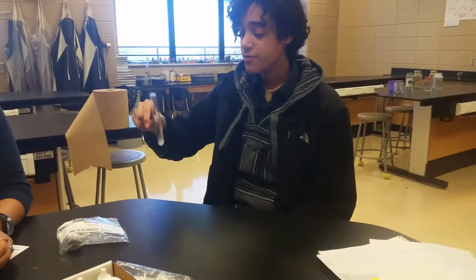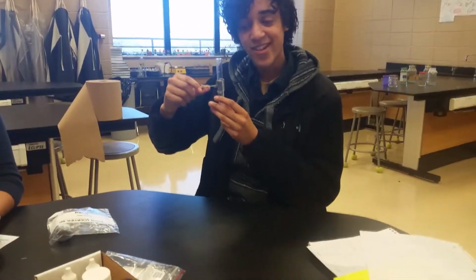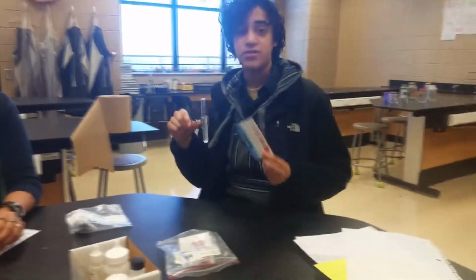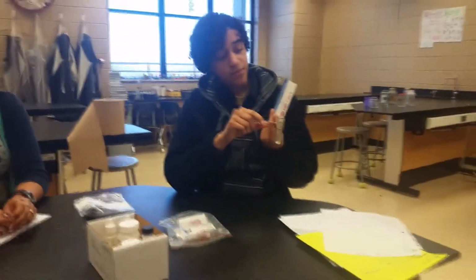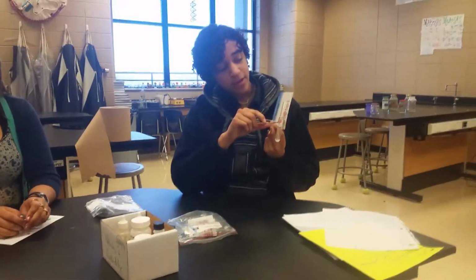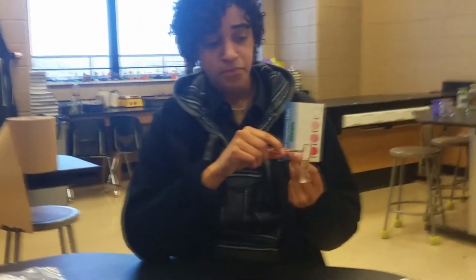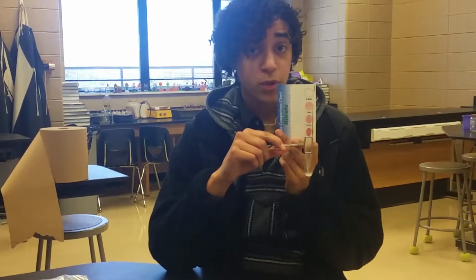Once this dissolves, it will create a color, and this is how we guided the levels of nitrate. It was qualitative, not quantitative. By the end of the test, we were around the 0 ppm to 5 ppm, and our data reflected that. We had 2s and 3s across the board, so there's not much variation.